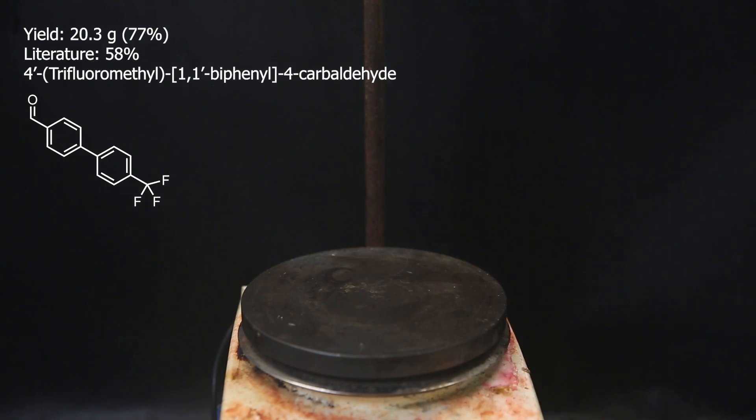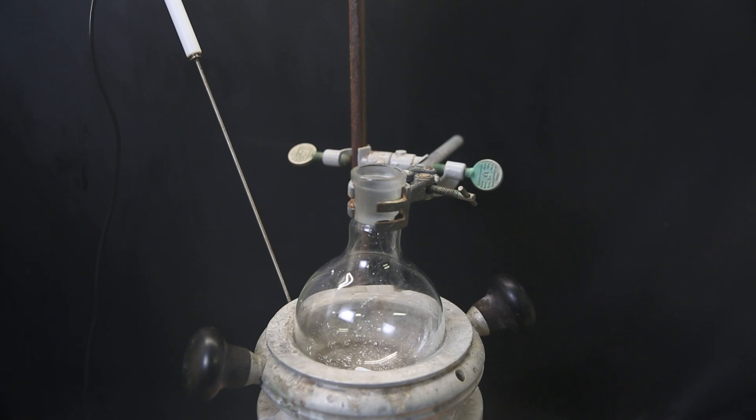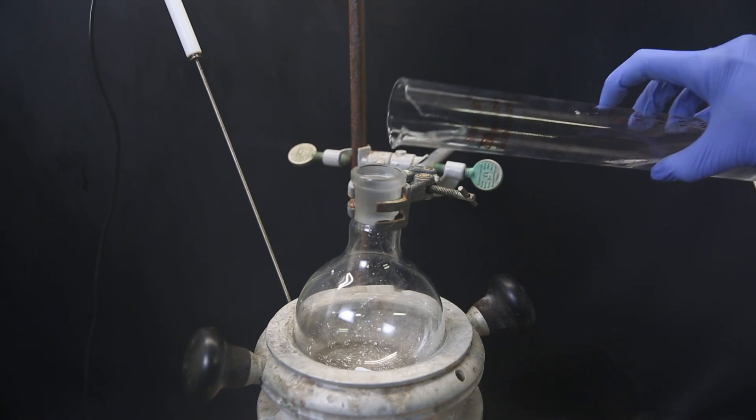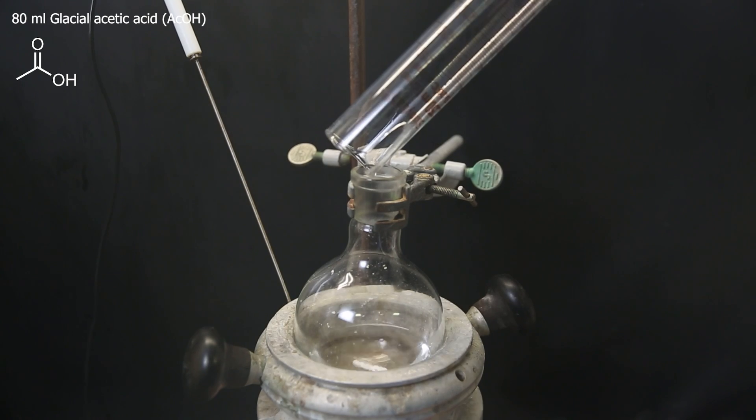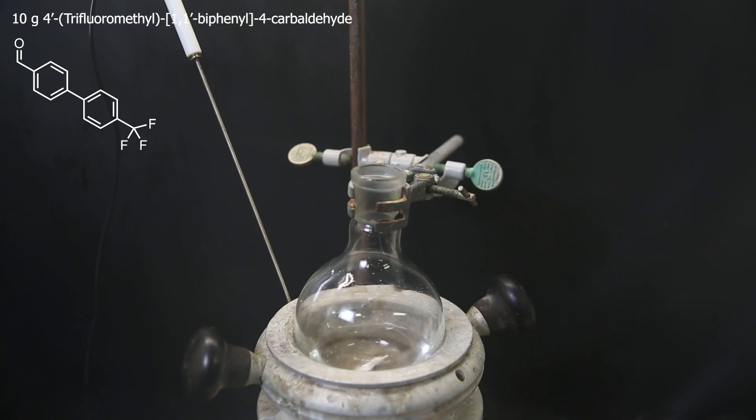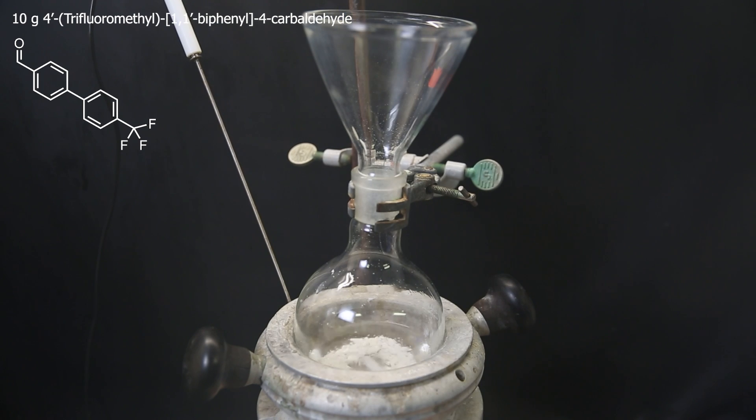Anyhow, moving on with the next and final reaction. I set up the flask that contains the product residue in a heating mantle and add in 80 ml of glacial acetic acid. I add in 10 grams of the previous product as the first reactant.